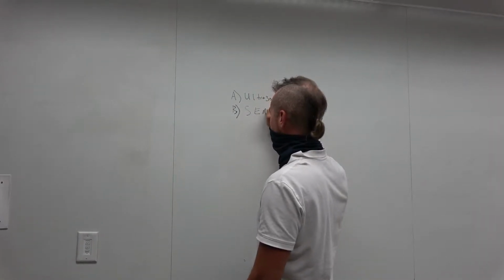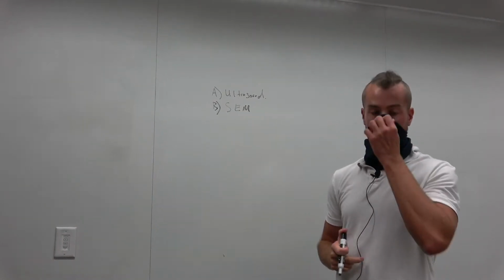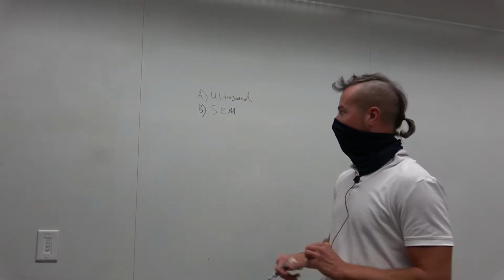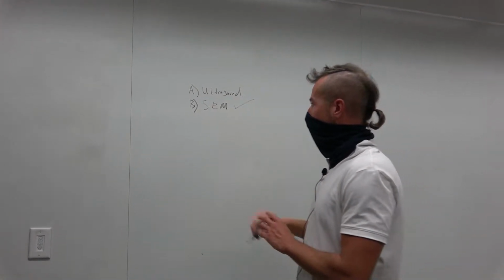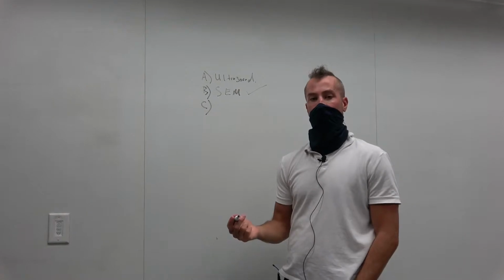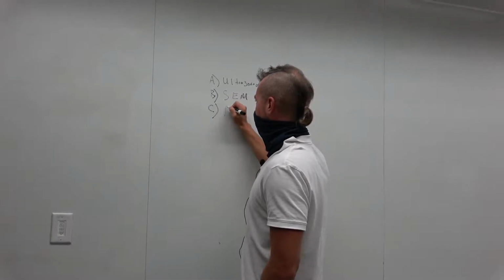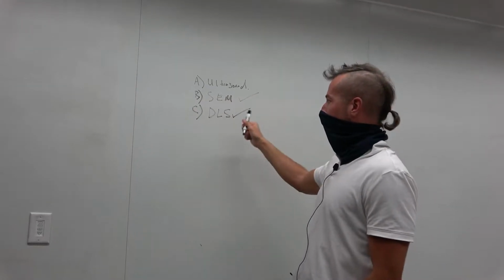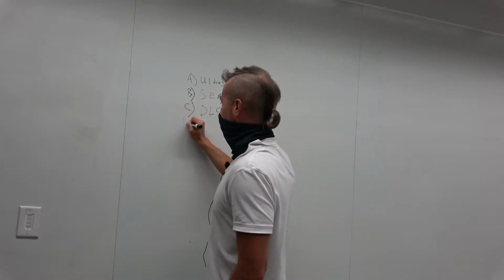So one is SEM. And so you've learned a lot about SEM during the instrumental module, so I'm really not going to record anything for the context of this experimental module except to give you the data. So SEM we can pretty much largely consider to be done. And then C is another type of size analysis. So we already did DLS. So DLS, again, we're just going to give you the data because you've spent a lot of time doing DLS already. But I'm sorry, the fourth one, I misspoke.